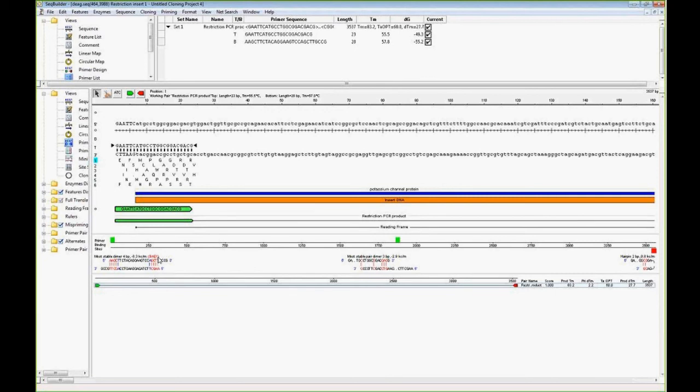There's numerous instances where I've come across customers where this applies. For example, a T7 promoter primer historically is considered a bad primer if you look at the nearest neighbor method, the presence of stable dimer, hairpin, stable pair dimers, and so forth. Just because we say there's a result here you may need to take into consideration doesn't mean the actual primer won't work. But yeah, you would need to right-click on that primer and work on that primer pair, and then you could save that accordingly in the project.